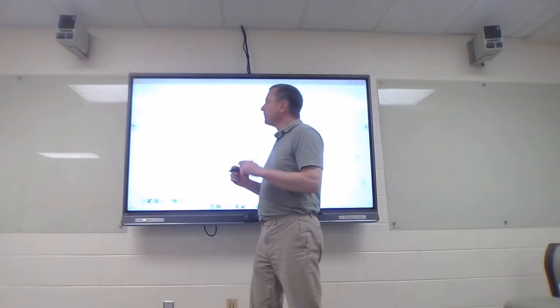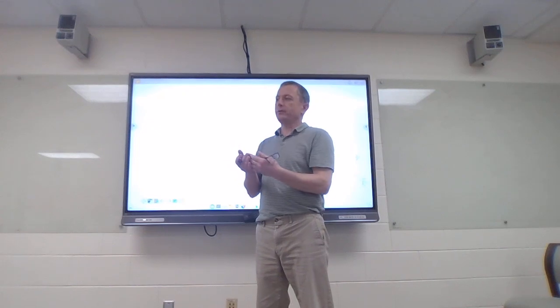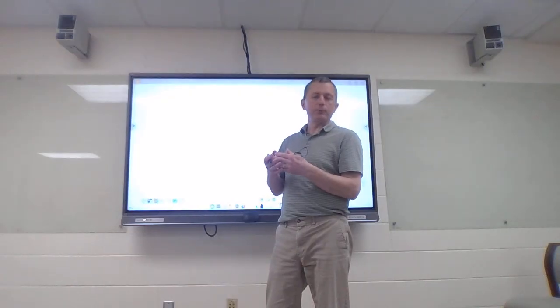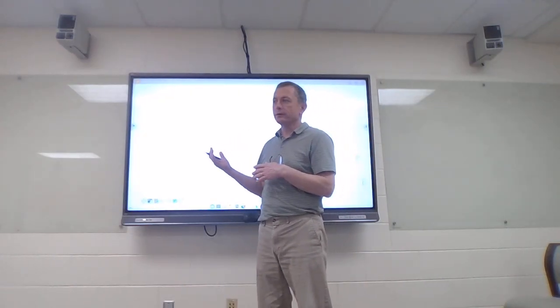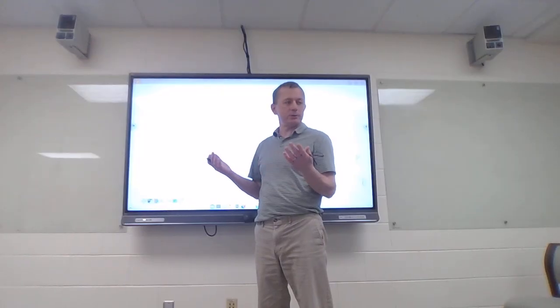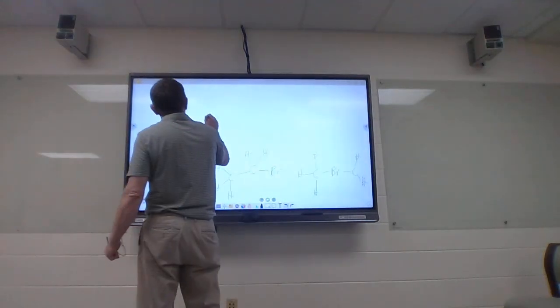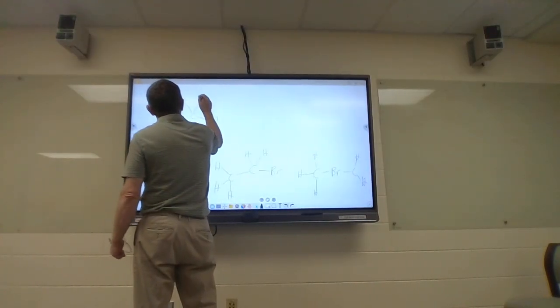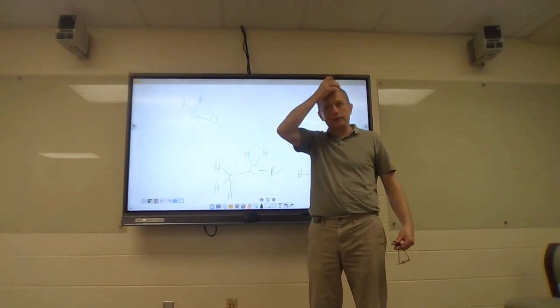So let's look at the peak that's lower again, right? We got a peak down there at about 3.5-ish again. So in the same range, but it can't be hydrogens on a carbon next to a bromine this time around. They must be hydrogens on a carbon next to an oxygen. So we know, again, that we can just go like this, and it's integrating to 2, right? So let's put 2 hydrogens on there for now.